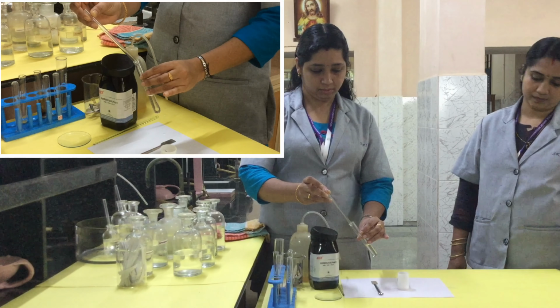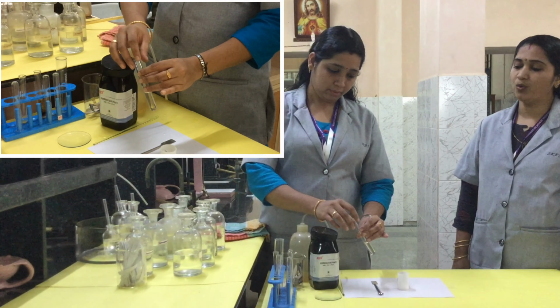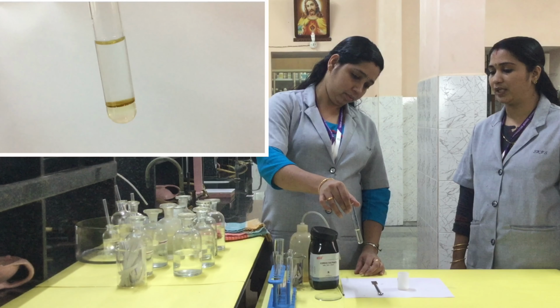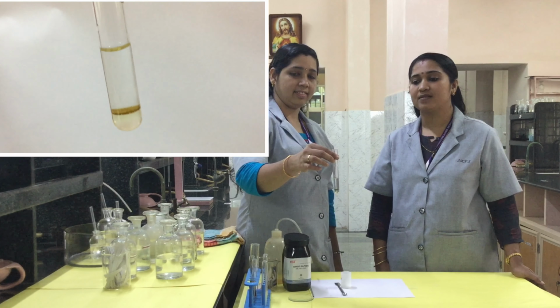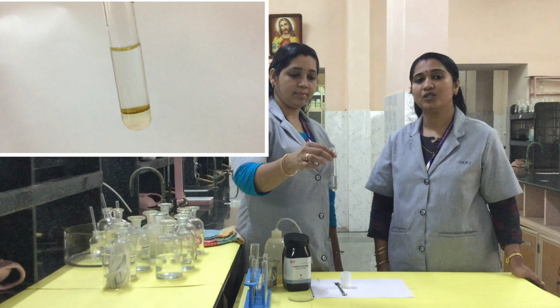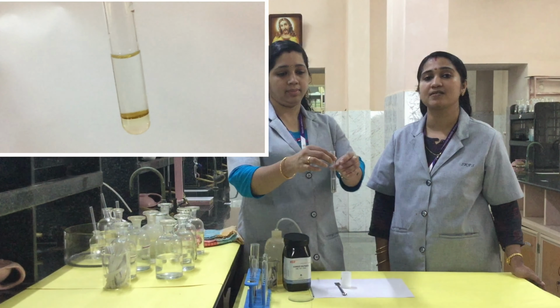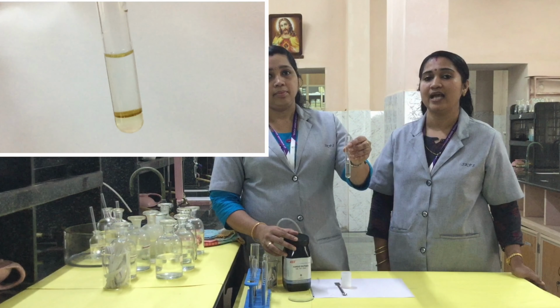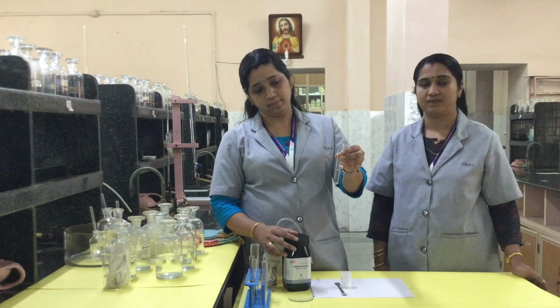Observe the change. A brown ring will be formed at the junction of these two liquids. So the presence of nitrate is confirmed. We analyzed the anion, nitrate, as present in the salt, and we confirmed its presence by the brown ring test.